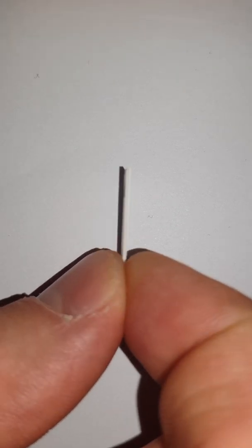There is a little QR code on the back side of this sensor. And that little QR code, as you can see here, immediately with today's smartphones, gives you information about this sensor.